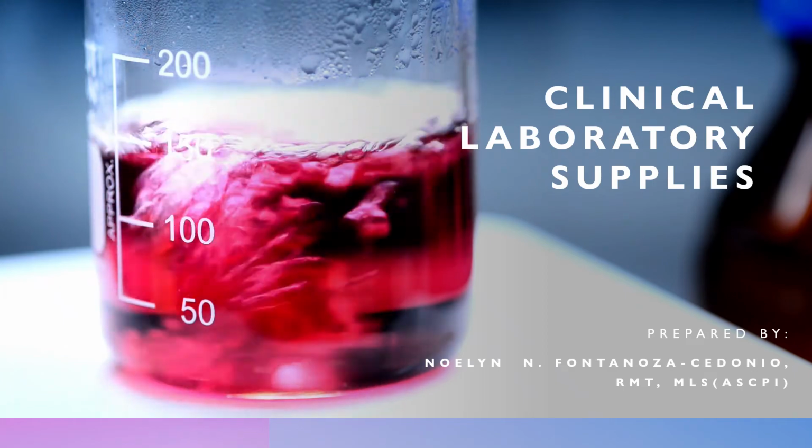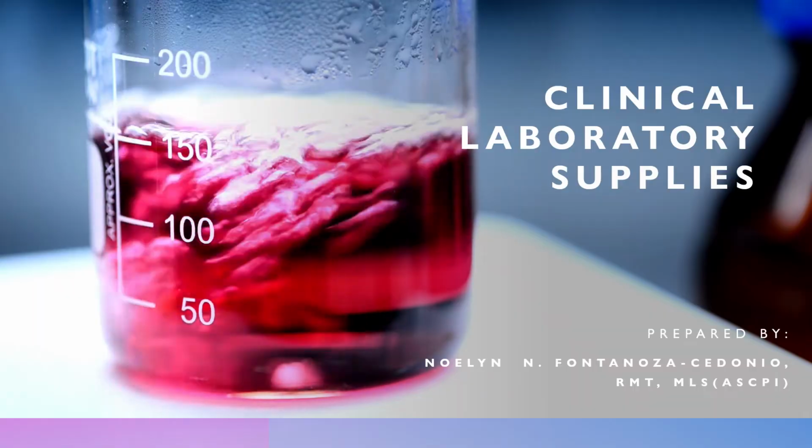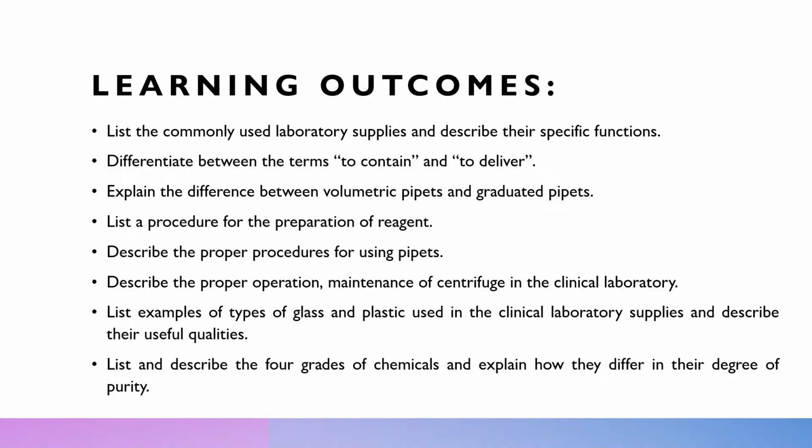Good day, class. Welcome to our next lecture topic regarding clinical laboratory supplies. At the end of this lecture topic, you are expected to list the commonly used laboratory supplies and describe their specific functions. You also need to differentiate between the terms to contain and to deliver. This refers to the different pipettes that I will be discussing later.